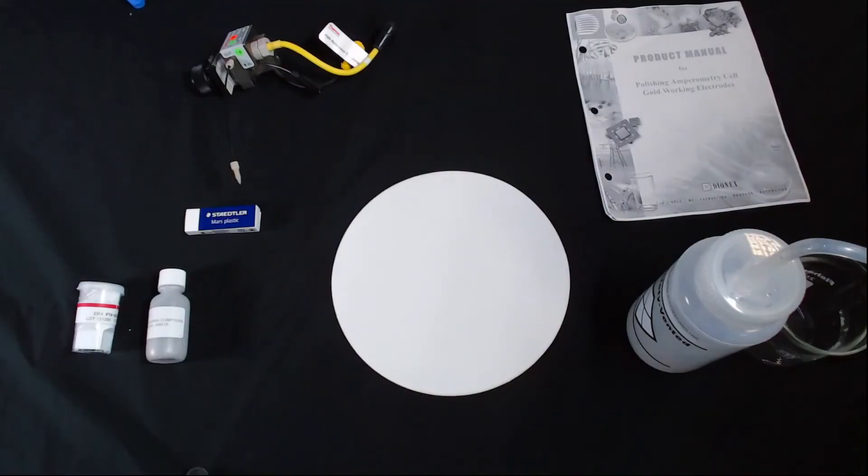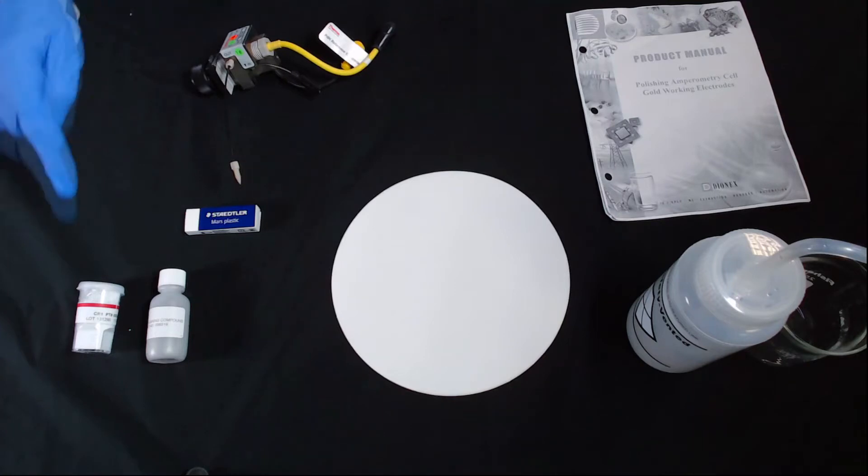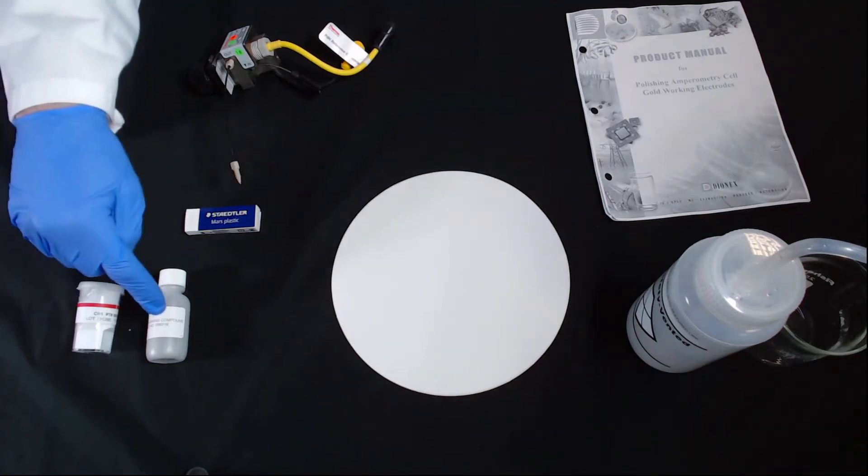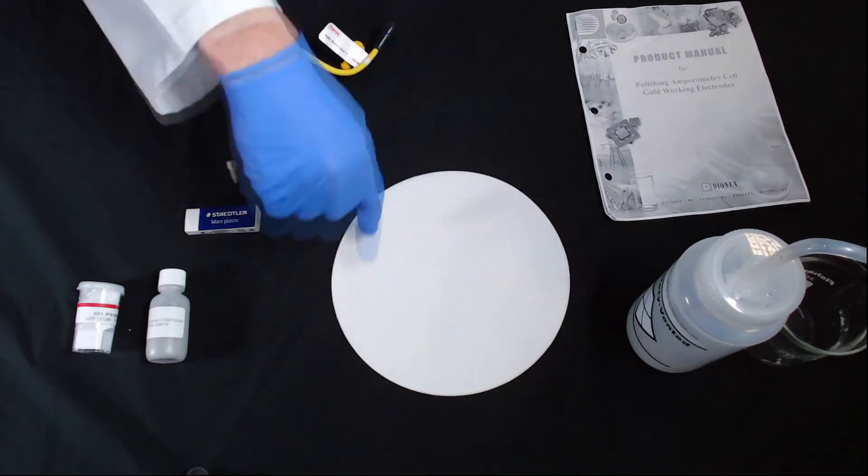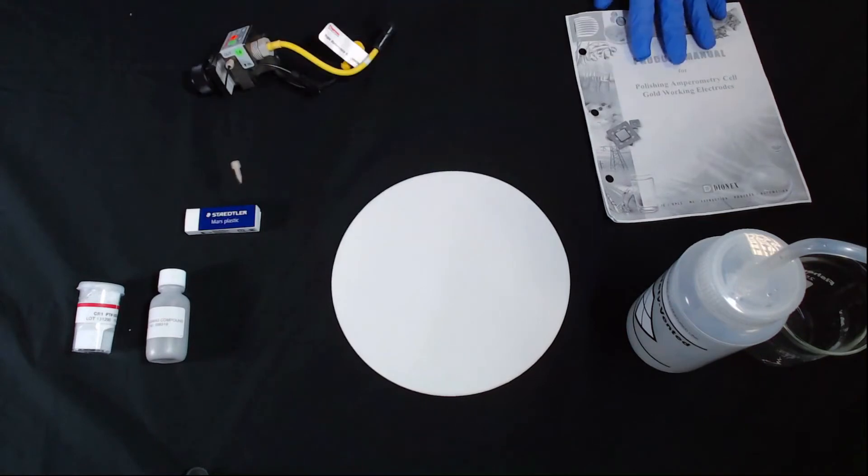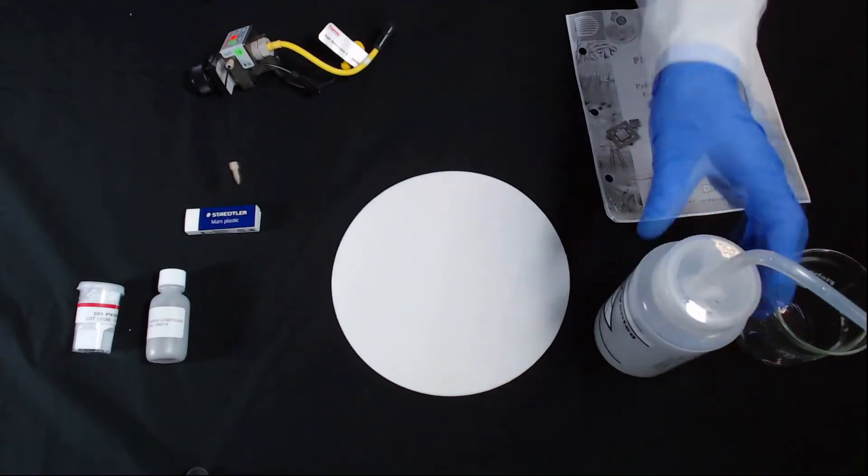There's a polishing kit available to polish the working electrode. In the kit you'll get the fine and coarse polishing compound, some discs to do the polishing on, and a set of instructions. You'll also need some deionized water.